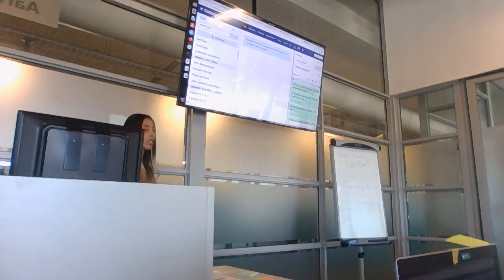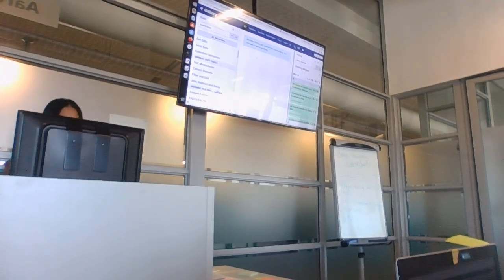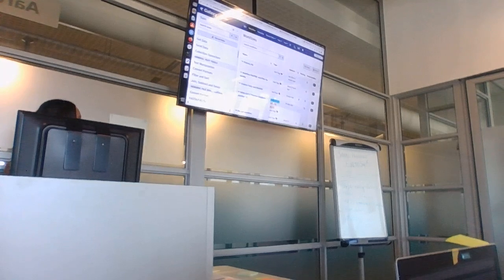Now, remember I said, if everybody's got this, do you remember where to find your workflow? Go find your workflow. Is mine the only one that looks like this, or do all of your buttons look funny? Mine's okay. Yours is fine, and yours is showing a play button. Okay, that should have a play button by you. By me, it's some funky something.